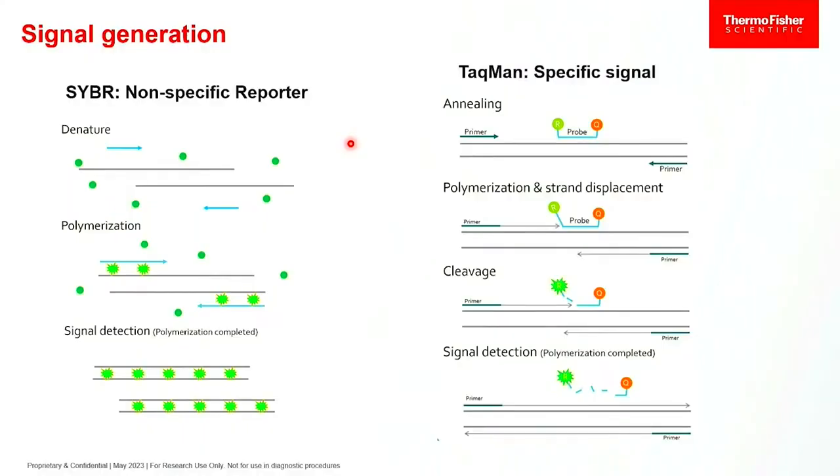No. I think you're trying to combine Sanger sequencing with qPCR, and no, they work a little differently, because it's about getting fluorescence without background fluorescence.